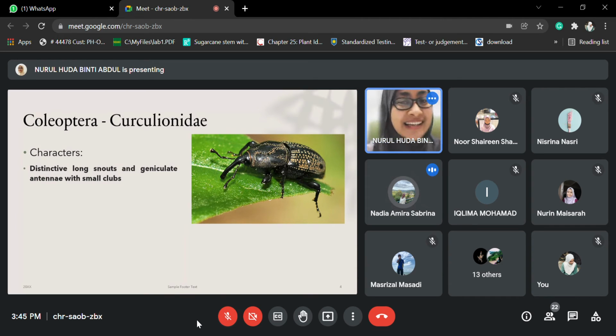Well, okay. This one is a bit tricky because it's not really posterior and it's not anteriorly either. If you can imagine, posterior end means backward, but this one is not actually like that.